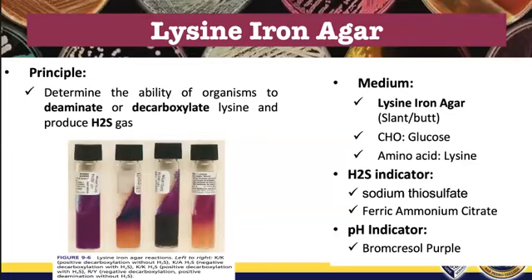Also, to note, decarboxylation occurs anaerobically on LIA. Therefore, it is detected in the butt portion. So our LIA, this one, has a slant and a butt. So decarboxylation is observed at the bottom because it occurs anaerobically.